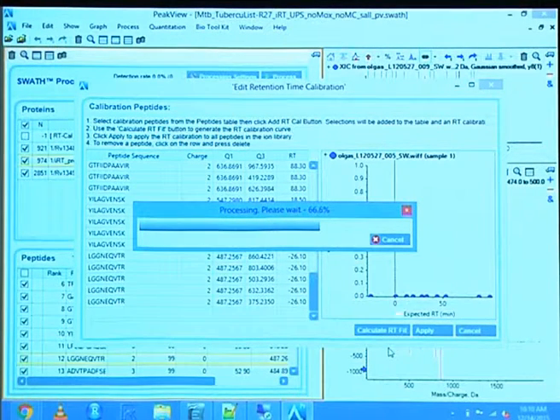But you also see here that there's quite some space here as well as here. So with these synthetic peptides, although well spaced, they were originally generated for, I think, SRM, so shorter gradients, not like here, 3-hour gradients. It might be worth picking some more.